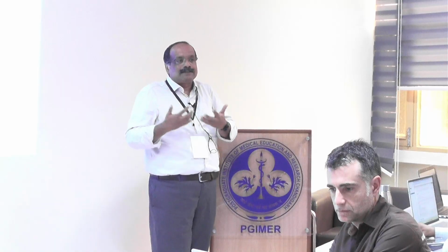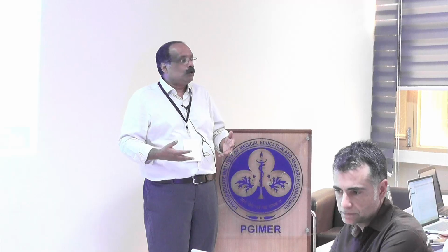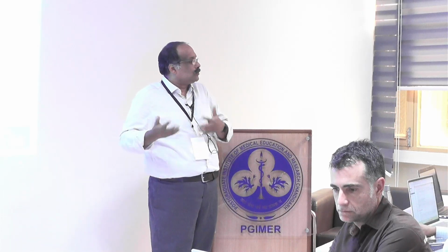So the flow cells and the sequencers are opening up new applications, such as multiomics analysis on the flow cells without sequencing, imaging based applications. New applications are being developed and new capabilities are unlocked, and sequencers are moving from just sequencing to becoming instruments to study multiomics, like cell morphology, protein abundance, in situ sequencing, and perturbation analysis at scale. Things are actually changing, and this is the most exciting time for genomics.